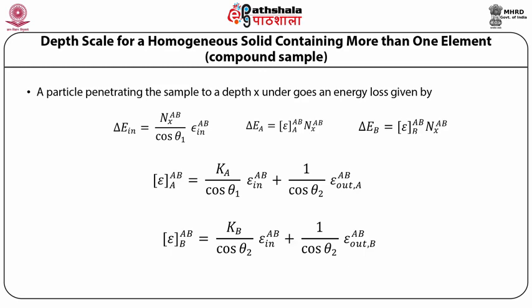The energy loss delta E out along the outgoing path depends on the collision parameter.